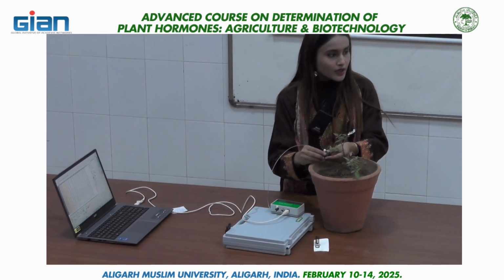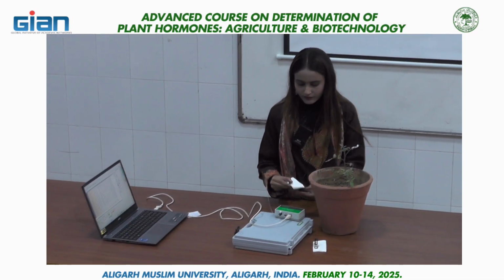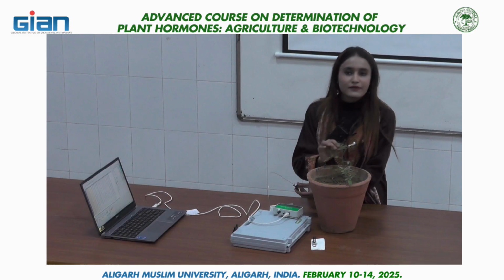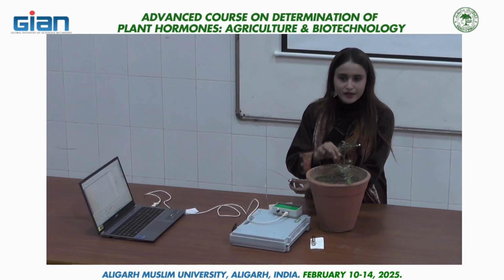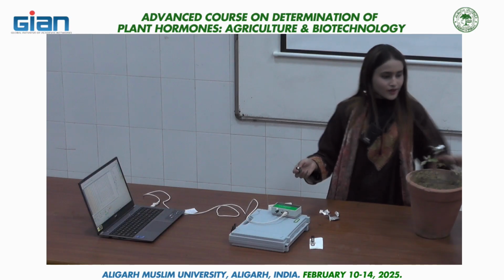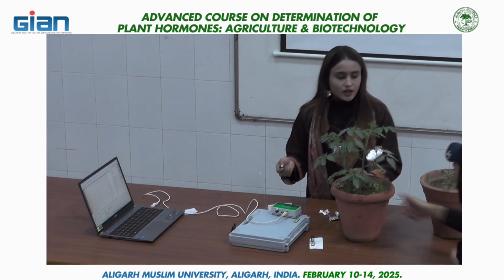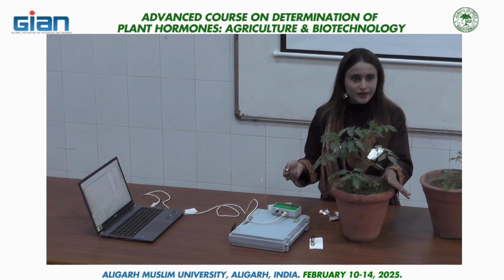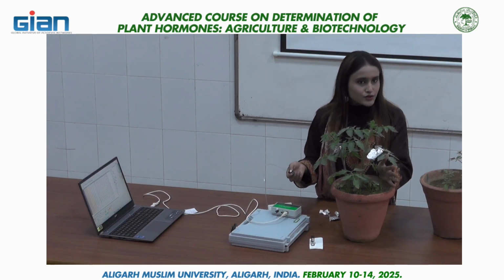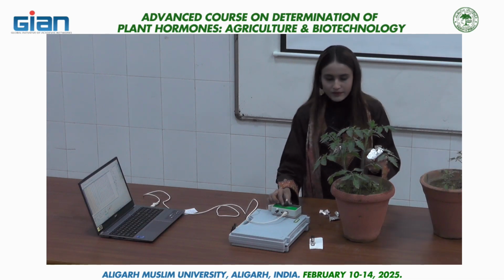Now moving forward to hormone treated plants. As these plants have dust and dirt particles, they should be cleaned, or your readings will be affected. Now this plant is hormone treated. So what do you think, should the Fv by Fm value increase compared to the control set? Let us see.